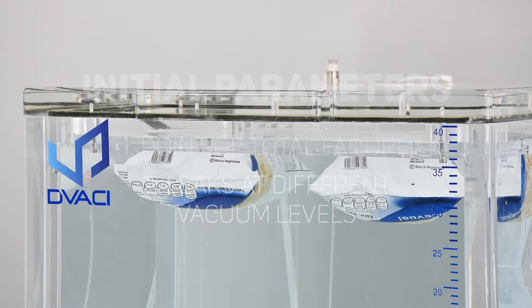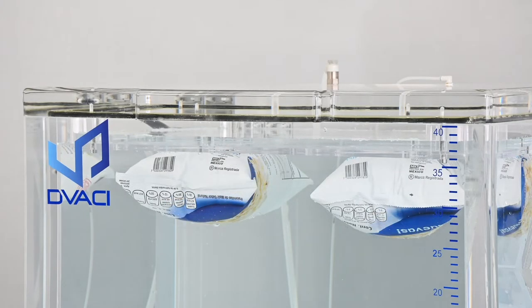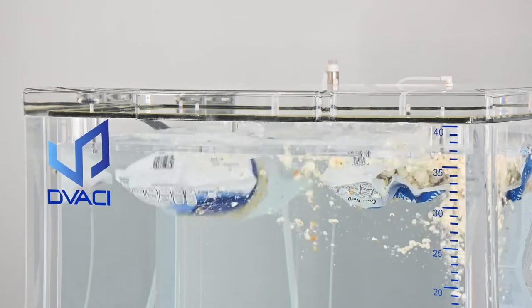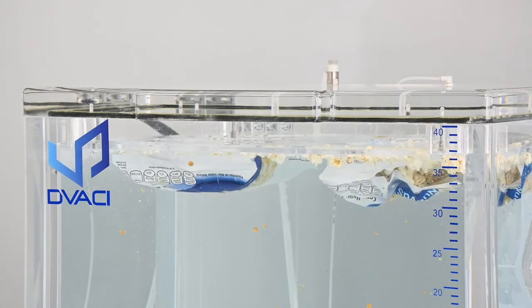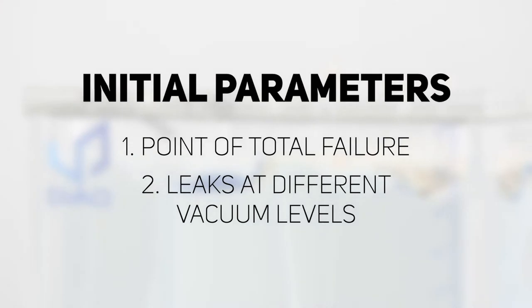To determine the maximum level of vacuum that a package can withstand, slowly increase the vacuum level until complete failure of the package is reached. Using multiple test samples will yield a more reliable result.